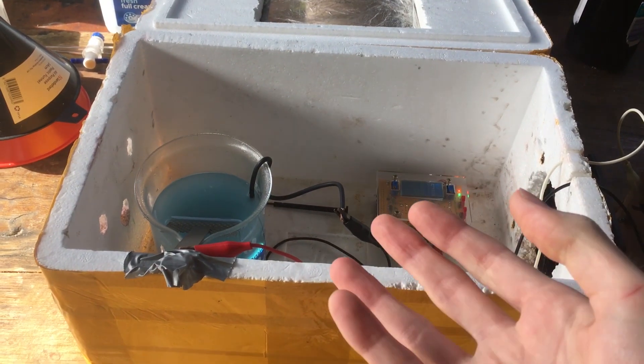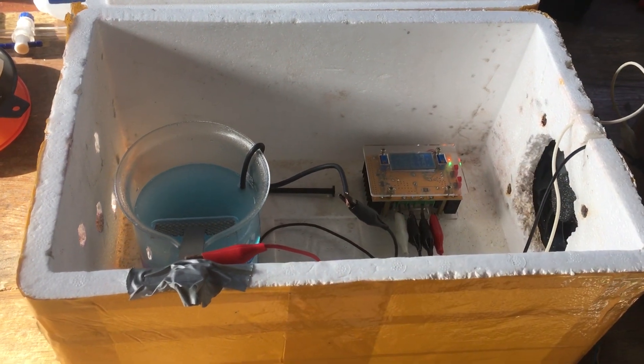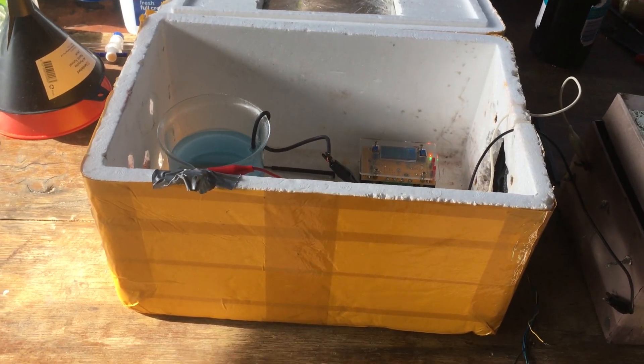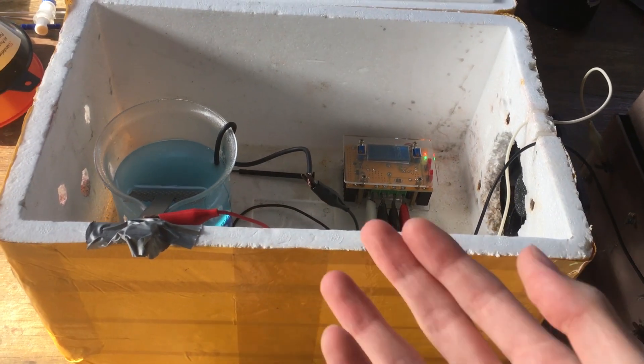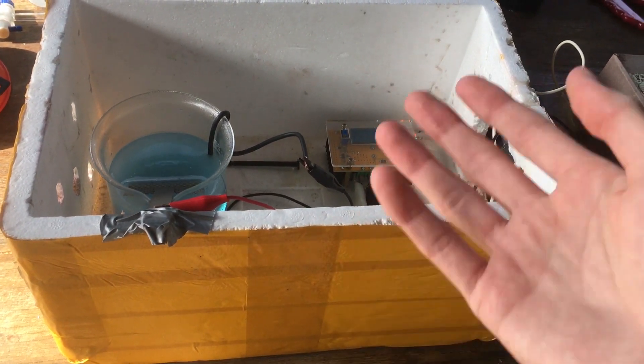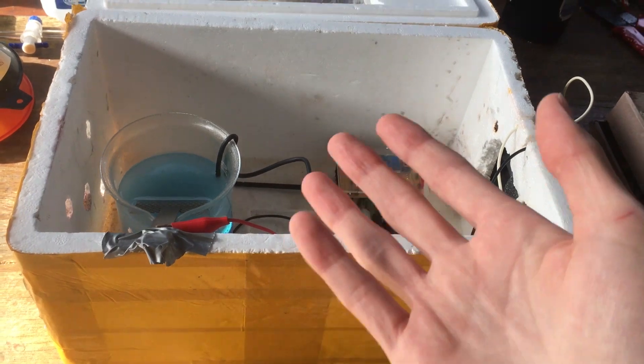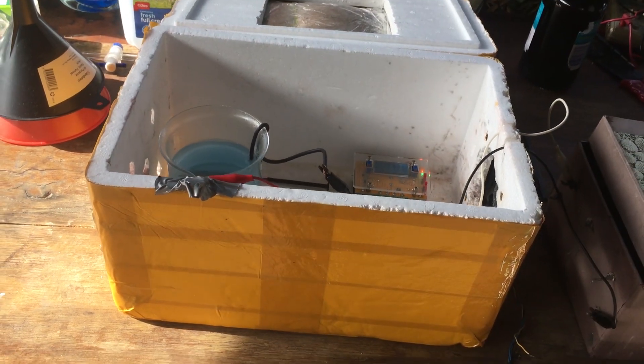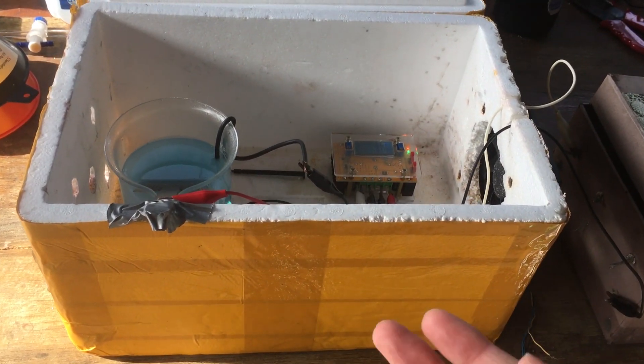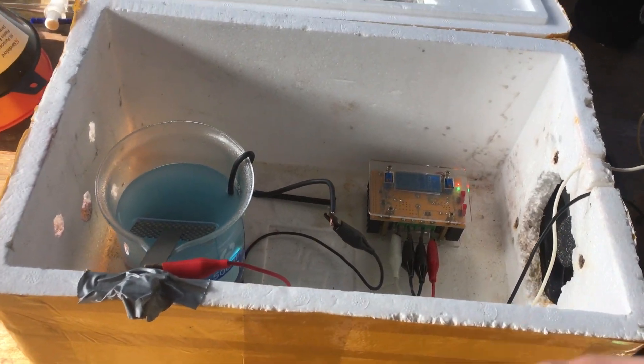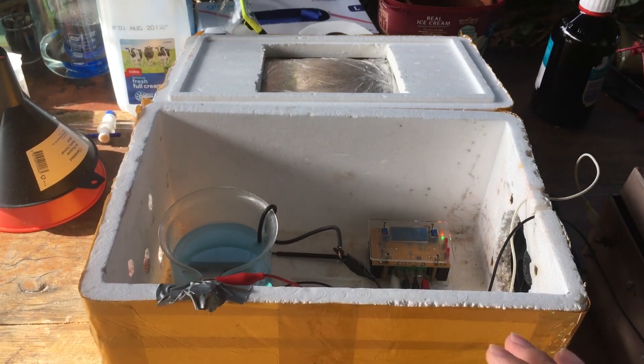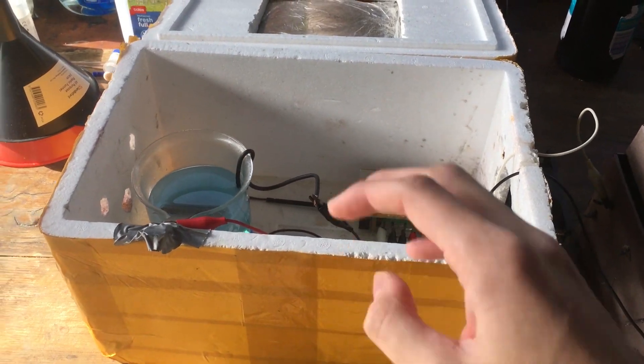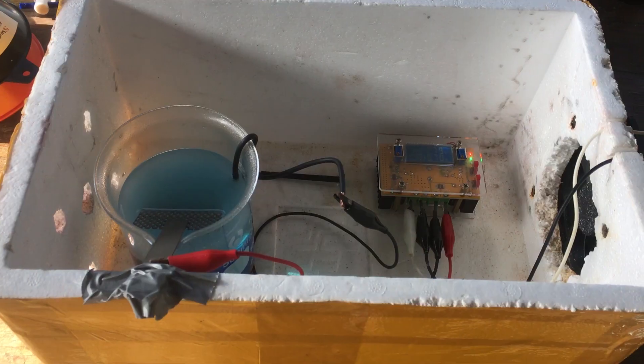Now, I know calculating the amount of charge that we've put through a cell given a certain current and a certain amount of time isn't really all that hard. You just multiply the number of seconds by the amperage that you're putting through the cell, and that'll give you the number of coulombs that you've passed through the cell. And then you can divide by the Faraday constant to get the number of moles of electrons that you've put through the cell. So it's really not all that hard, but I'm kind of lazy.